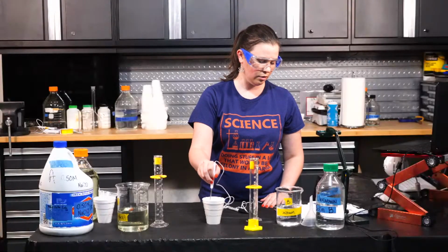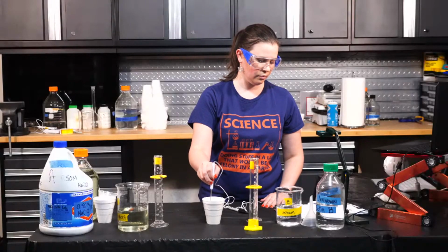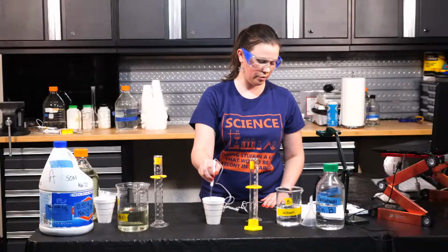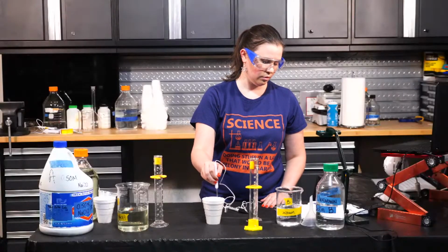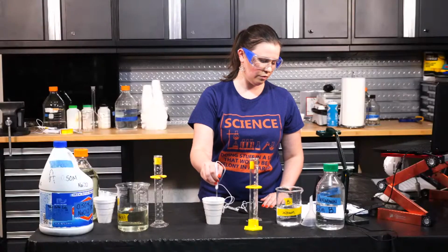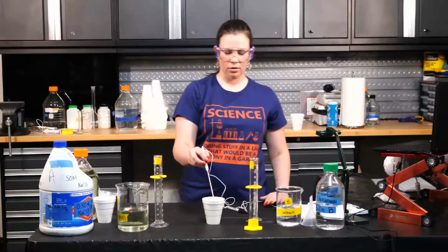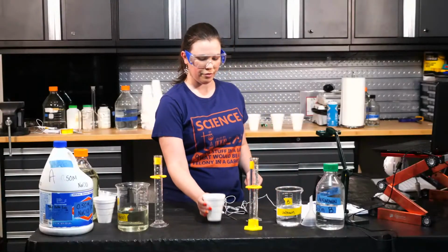23.9, 24.0, 24.0, 24.0, 24.0. And that seems to be our plateau, 24.0. All right, so that'll do it for level 5.